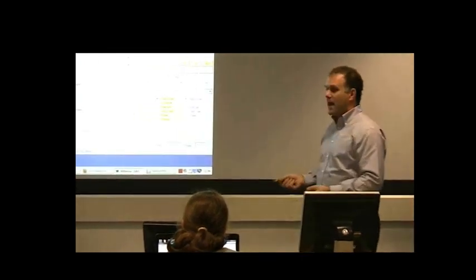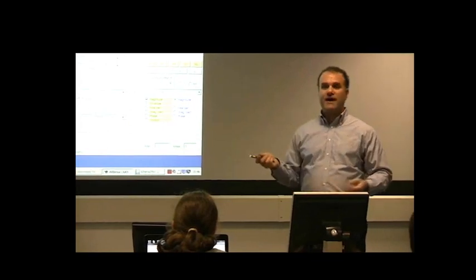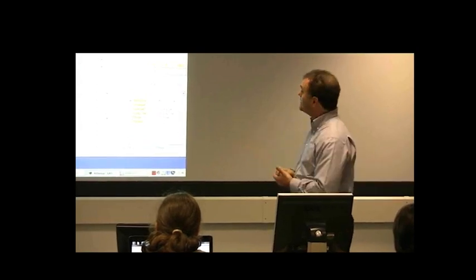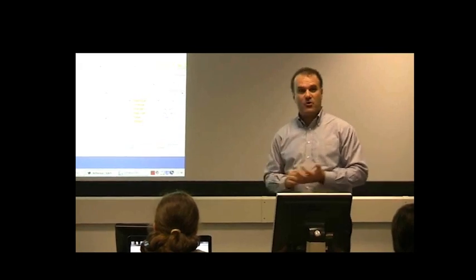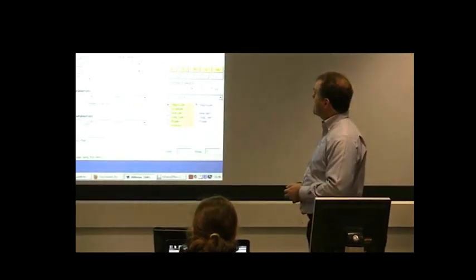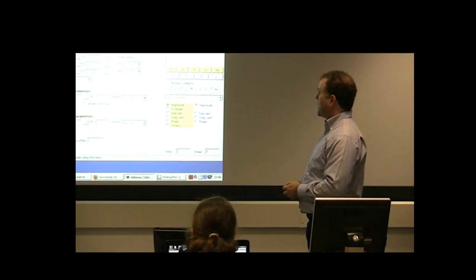But I have a hard time telling you a priori, to give you advice for different kinds of data, when you'd want to change that number. It's just one of the things that you can try. So perhaps at some point this week you can import some of your own data and play around with it. With these data, you'll find that it doesn't make a difference. All right, that's pretty much the whole story.